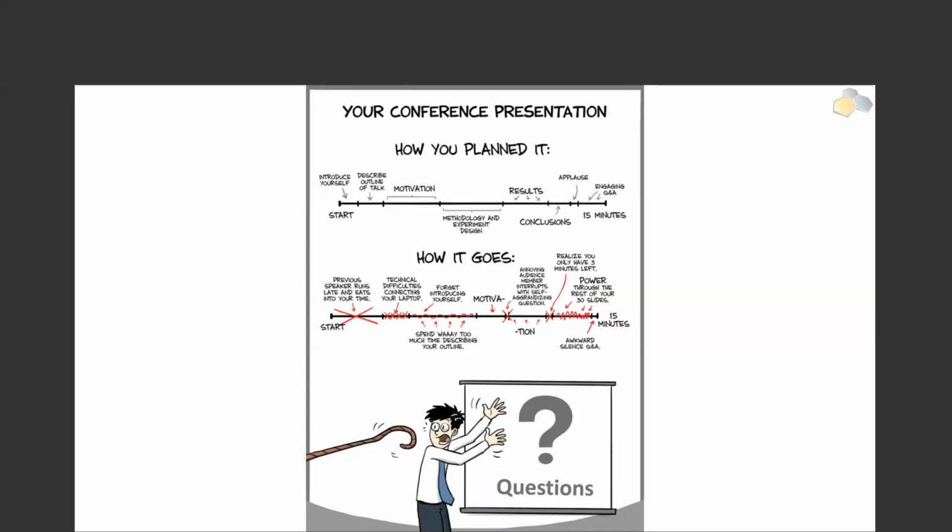And if you go into the world of aligners, for example, this is becoming increasingly more complicated. And that's why the community in the field slowly shifts from the use of one aligner to another, and it's through experience and repetitive work that we develop some confidence on which tool is better implemented or which tool is better suited for which samples and which type of analysis.